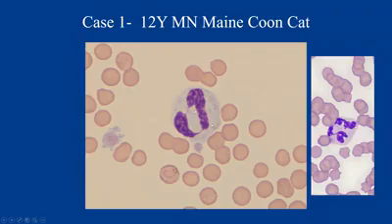So here we have another segmented neutrophil. We've got our nice thin nuclear bridges, our little nuclear connections, and we still have a fairly clumped chromatin. But something that is going on here is there is a lot of basophilia to the cytoplasm. So this cytoplasm is more blue. I know this isn't the best example because usually the cytoplasm would be more clear, but it's bluer compared to that cytoplasm. So we've got cytoplasmic basophilia.